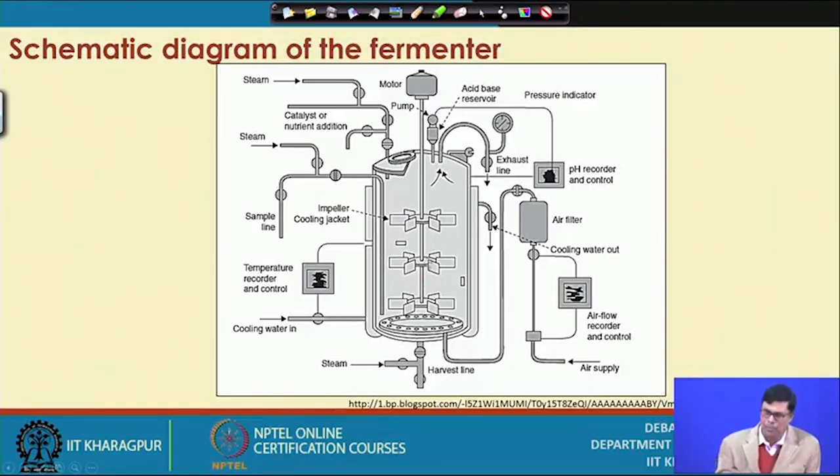In the lab, we can do the sampling very easily, because there is an outgoing air outlet. Am I right? In the exhaust, this is the exhaust line. Now here in this exhaust line, if you close this valve, then there will be air pressure here, and due to the air pressure, if you open this valve, then you can draw the sample and collect the sample, and you can do this very easily.